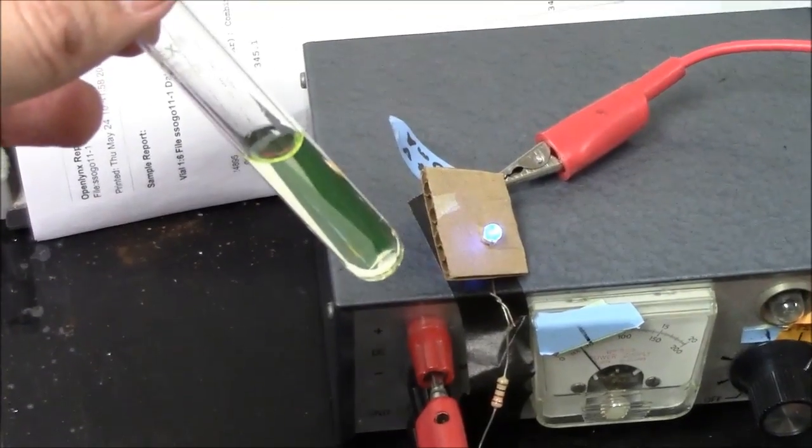I will do this in the dark. Alright, so there's my blue LED. Here's my fluorescent solution, and you can see that we get a nice green glow out of the fluorescein when illuminated by blue light. So this is the principle of fluorescence. It is a very sensitive method. We can detect quantities in the nanomolar concentration.